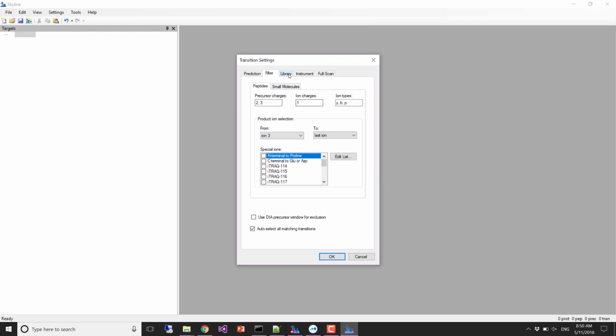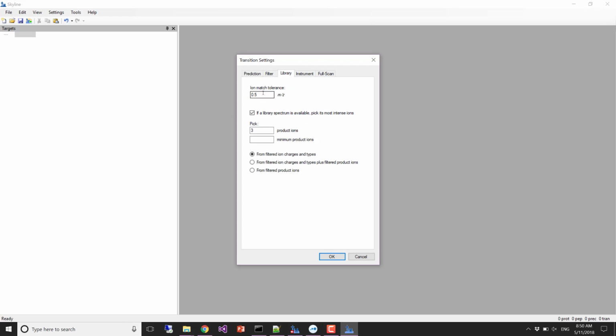And that's it. So, you can see actually that we have, okay, in our spectral library settings, before we build our spectral library, I think, yeah, so for our spectral library settings, we would like to say that we want 0.1 MZ, which is still really, this is DDA measured on an Orbitrap, so that's still really huge.